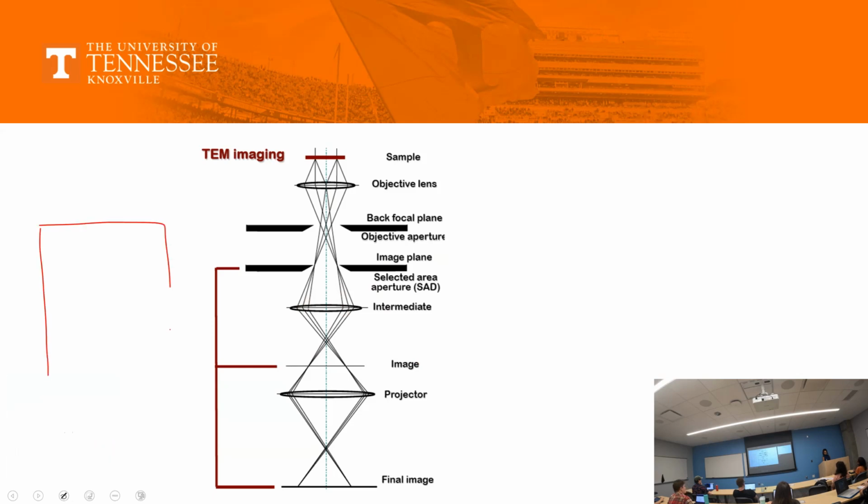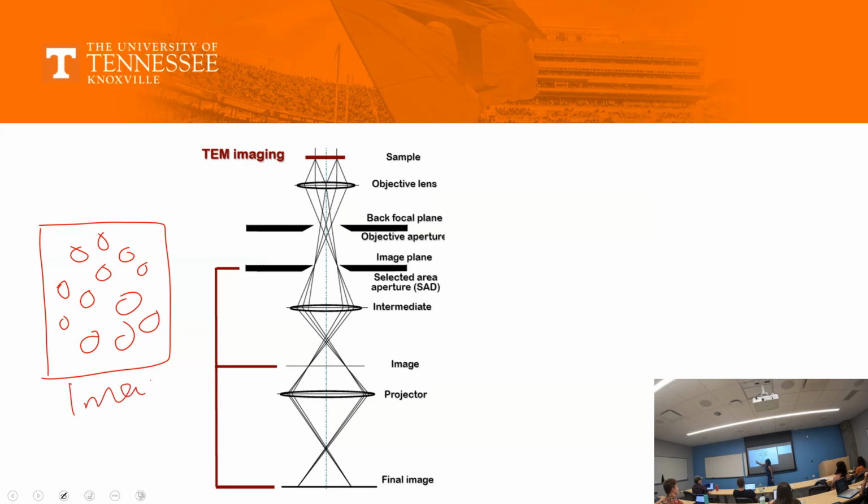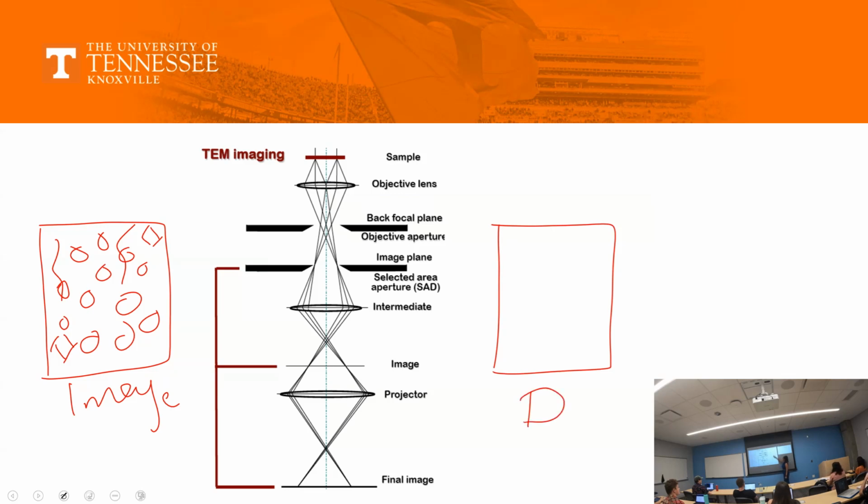So suppose this is the image, and I am seeing something, bubbles. And for example, these bubbles are at zone axis. Now somebody has to define for me what a zone axis in a crystal is. This is your image. And this has bubbles in it, dislocations in it. Also, let's make some voids in it because most of the people are from radiation effects, right? This is what you see. And once you have a D, you can have different patterns of a D, which comes by pressing literally the button D. And what are the different patterns that you can have?